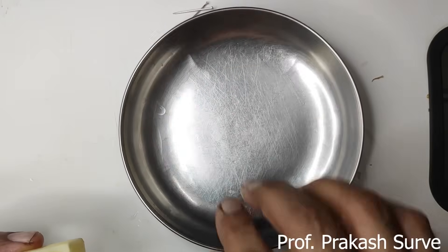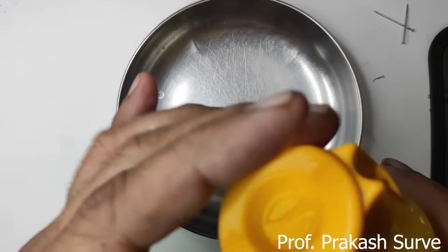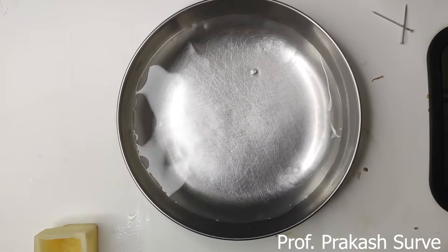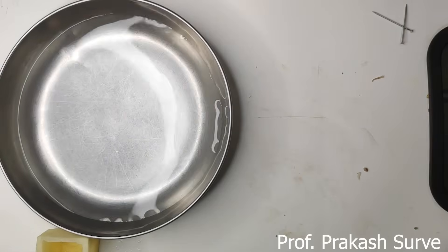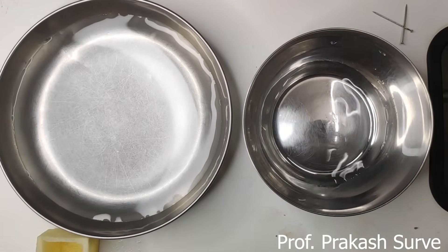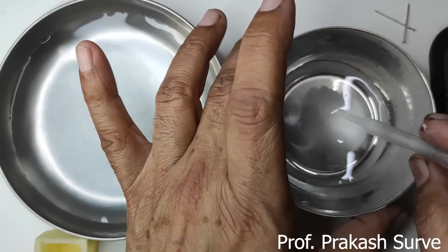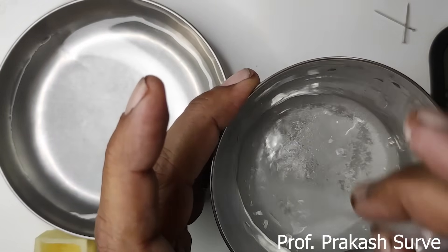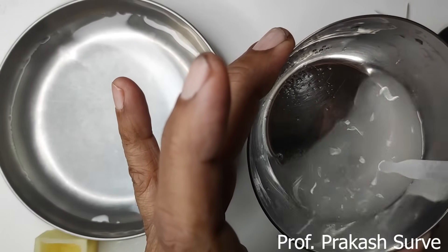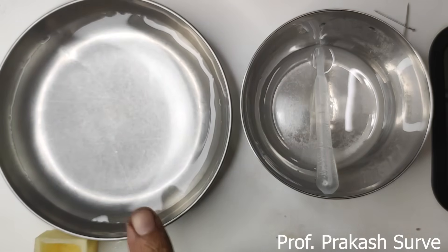First we will take the plate and pour water in it. Water is a hypotonic solution. Then in another bowl I will make the hypertonic solution by adding salt to water to make a concentrated solution. So now we have the hypertonic solution and the hypotonic solution ready.